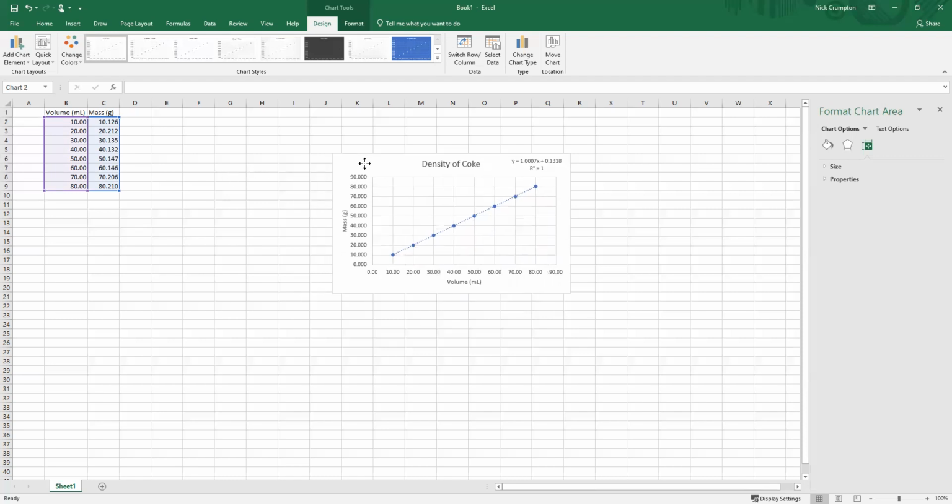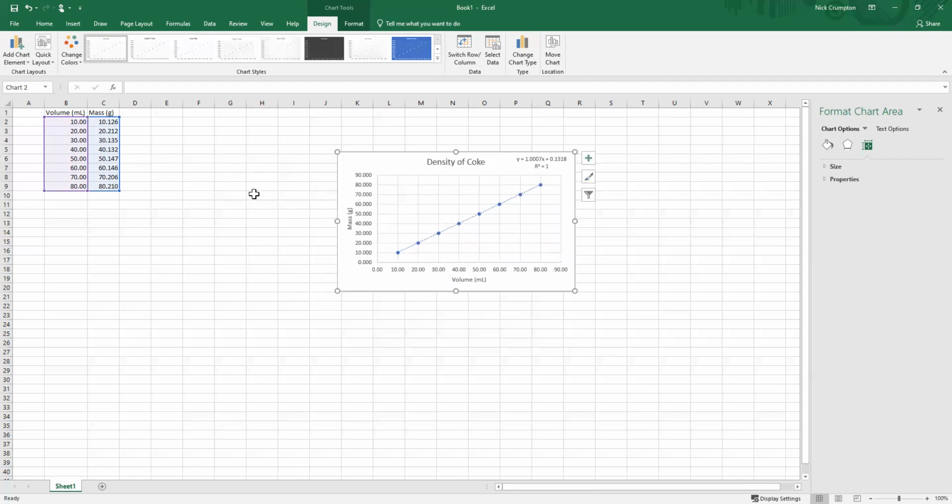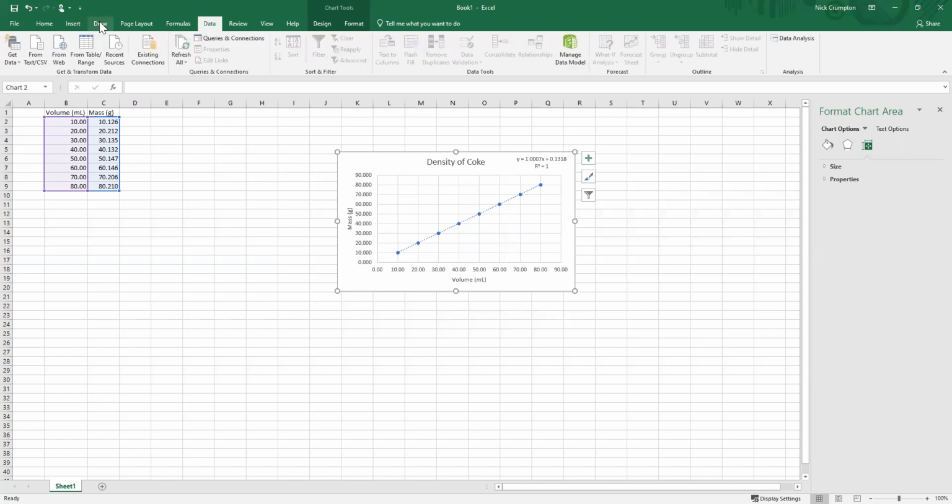So the last thing that we'll have to do with this is some linear regression using the data analysis tool pack. If you haven't yet, in that Excel document, there are instructions on how to enable the data analysis tool pack. If you've done it right, up top on your toolbar, if you go to data, somewhere over here in the top right-ish corner, there's going to be a logo or a little symbol that looks like this, and it may or may not say data analysis next to it, but when you hover over it, it should indicate to you, as mine is, hey, data analysis tools, right?